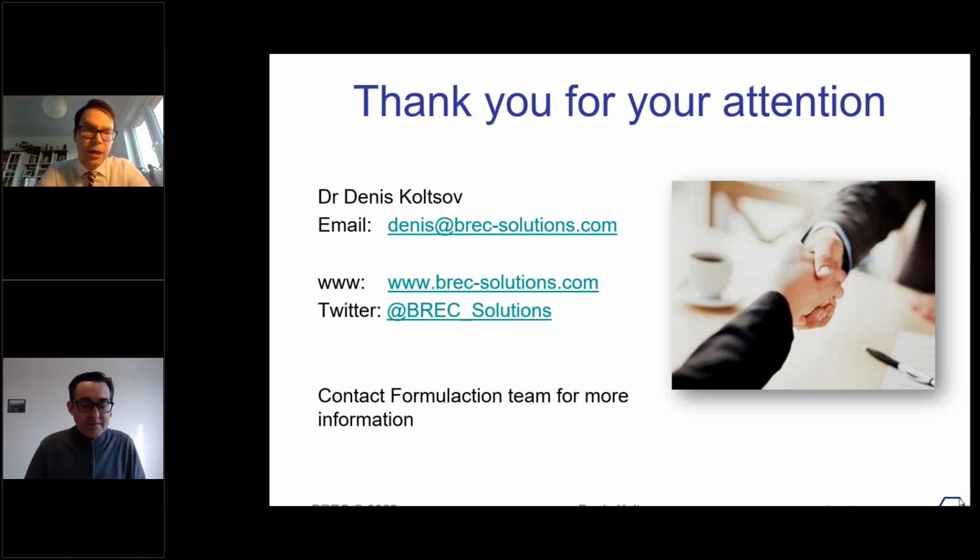Yes, definitely you can, as long as your volume fraction does not change. That means that in a lot of samples, you get a volume fraction that may change with height. So you'll have some sedimentation or creaming. That means that where your laser is, there may be something basically getting thin. Your dispersion will get thinner. So if it is uniformly doing that across the whole sample, then yes, this measurement is actually quite interesting in terms of seeing the aggregation process happening. Yeah, and that's because we don't dilute the sample. We take the sample as it is, and we can repeat experiments over time.